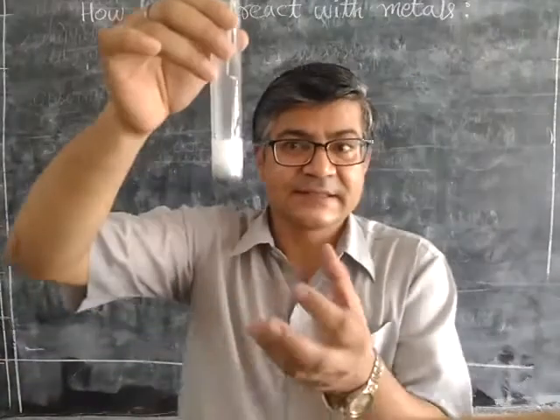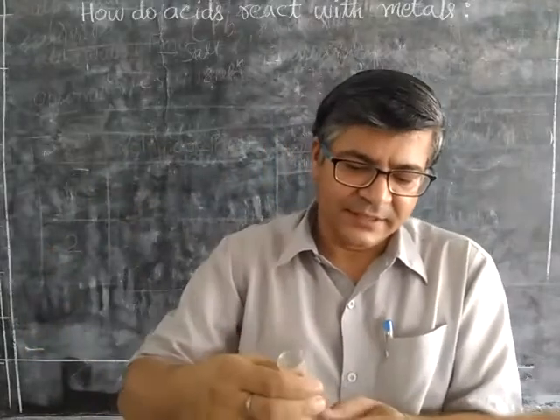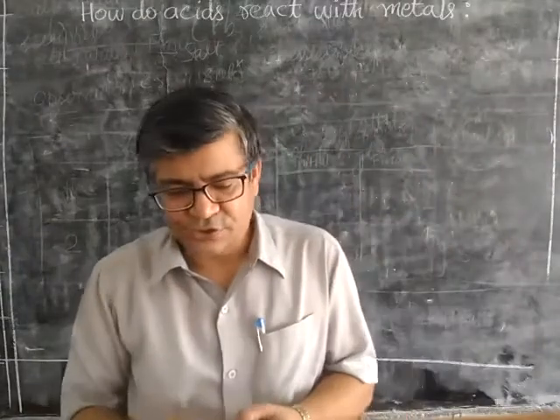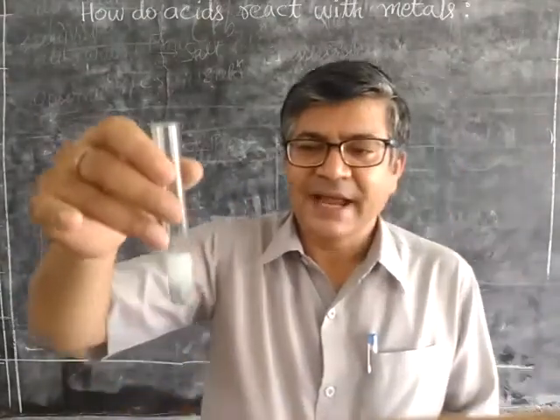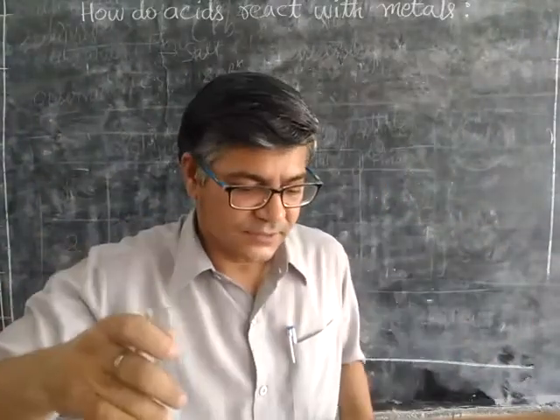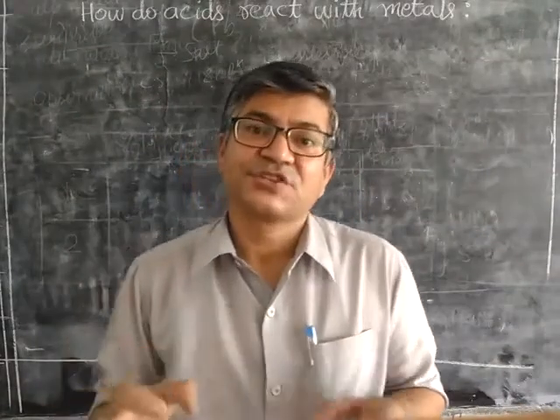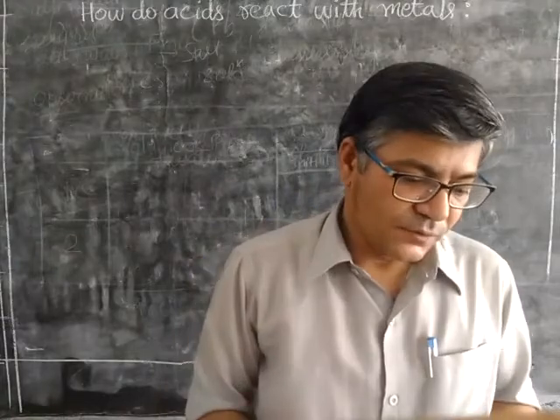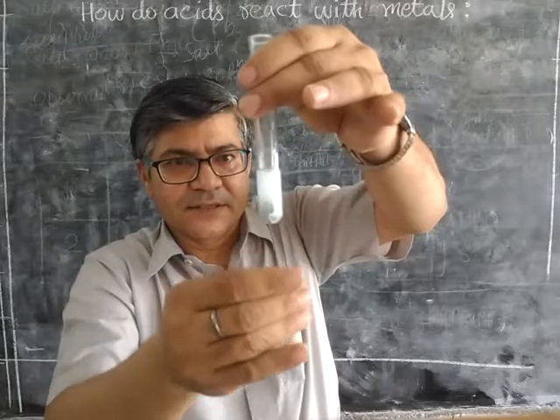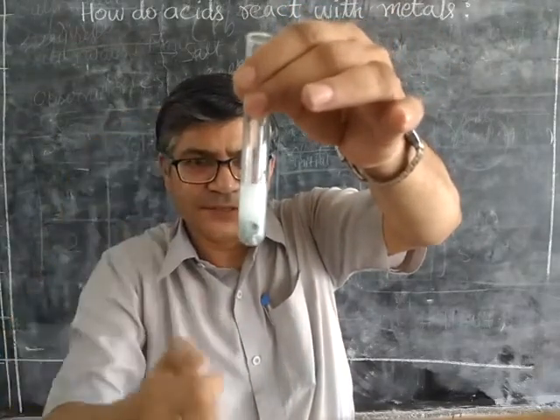This is the same reaction, and the popping sound you just heard is produced when the gas coming out of this solution is burnt, reacting with oxygen. In another way, we can say that the gas is being combusted, ignited. Now let's see once again what happens. The reaction has gained speed and you can see bubbles forming on the surface also.